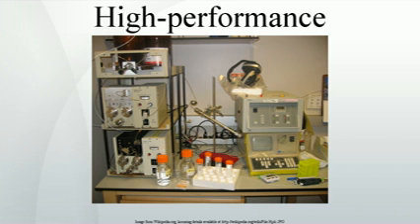HILIC most often uses a bonded polar stationary phase and a mobile phase made primarily of acetonitrile with water as the strong component. Partition HPLC has been used historically on unbonded silica or alumina supports. Each works effectively for separating analytes by relative polar differences. HILIC bonded phases have the advantage of separating acidic, basic and neutral solutes in a single chromatographic run.